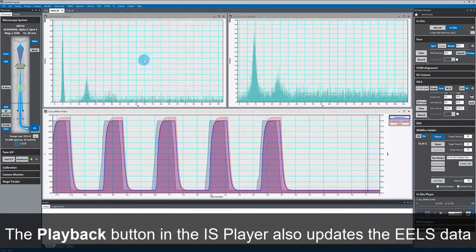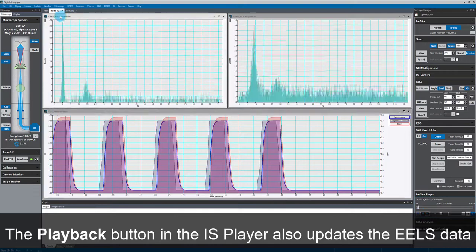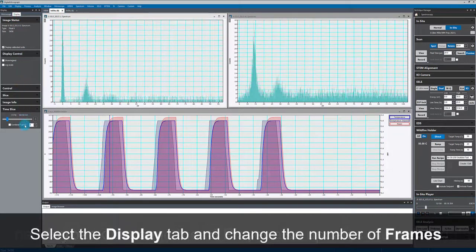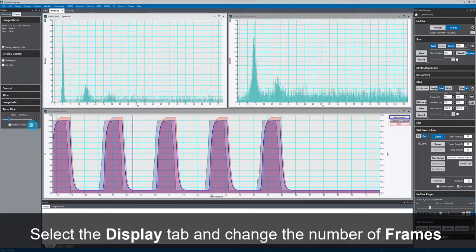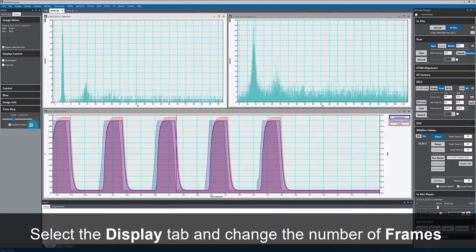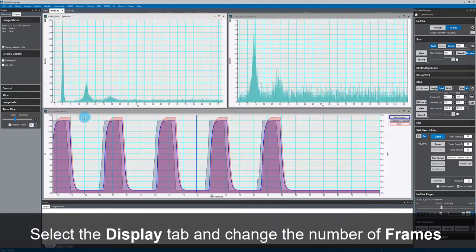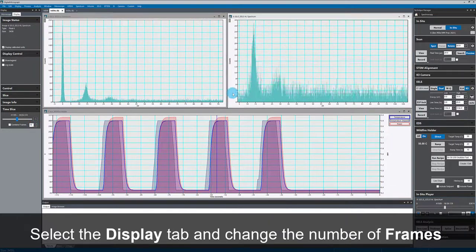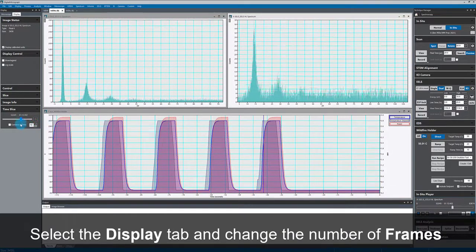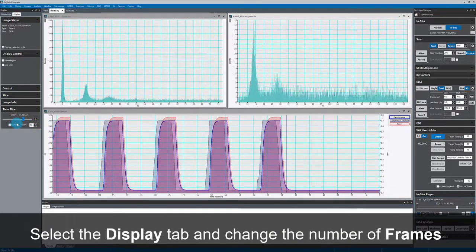I can also sum together several frames of my EELS data, and I can even sum a different number of frames for the low loss and high loss regions of the spectrum if I want to.